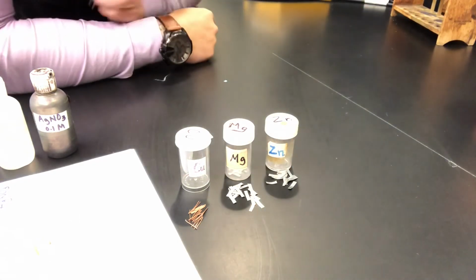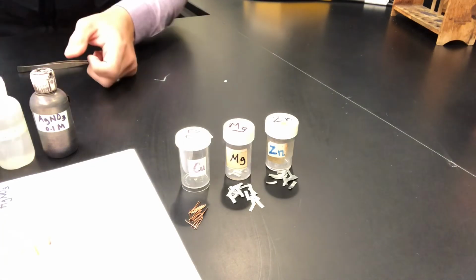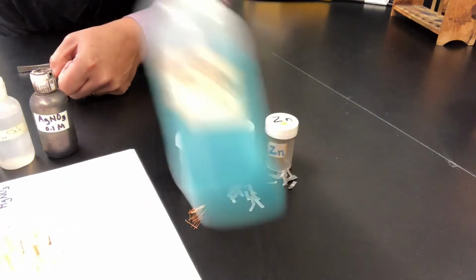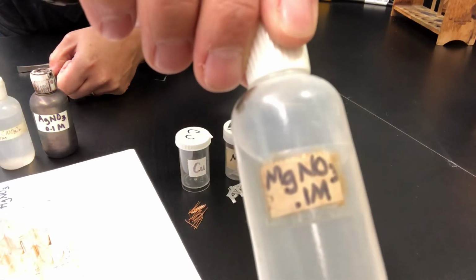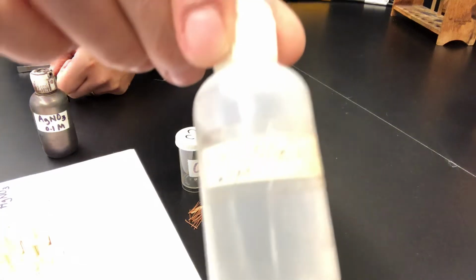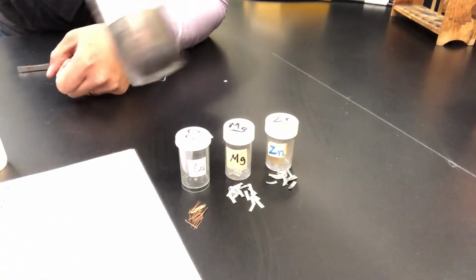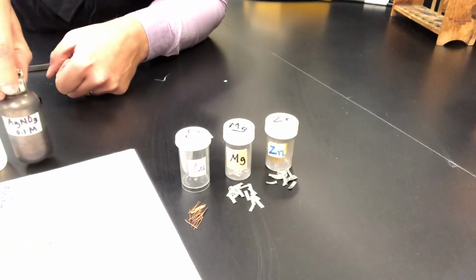So we are going to test all 3 of those metals today in 3 different solutions. We're going to react it with copper 2 nitrate. We're going to react it with magnesium nitrate. We're going to react it with zinc nitrate. And we're also going to react it with silver nitrate. So this actually has silver in it.